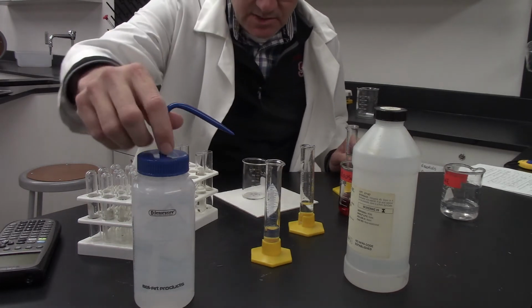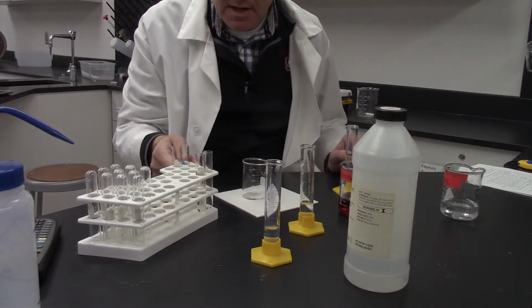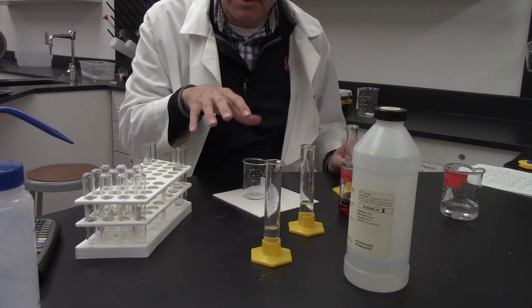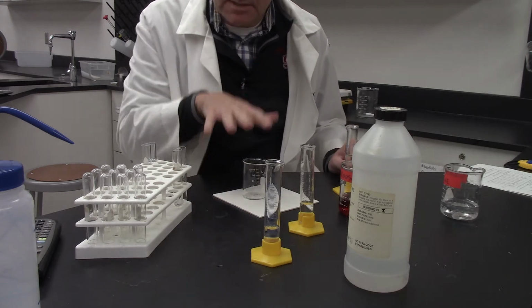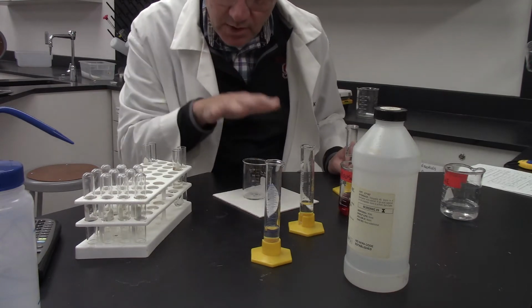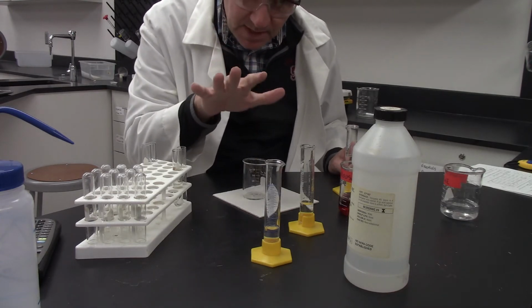One of the things that you're going to have to calculate is the concentrations after they are mixed. What's going to be important is that on all of these, we're going to run the reaction on a total volume of 50 milliliters. That's going to be the common thread.